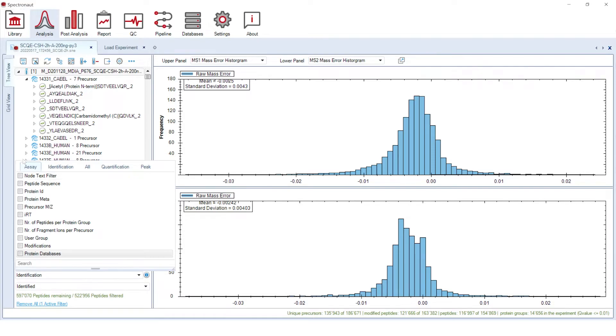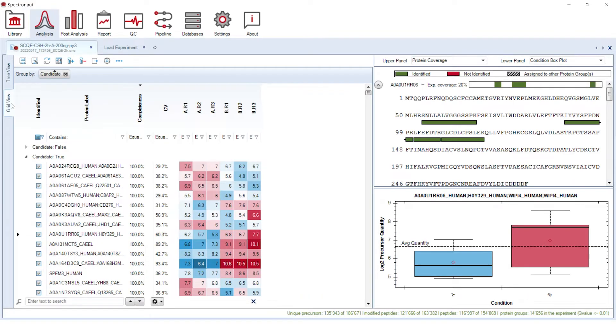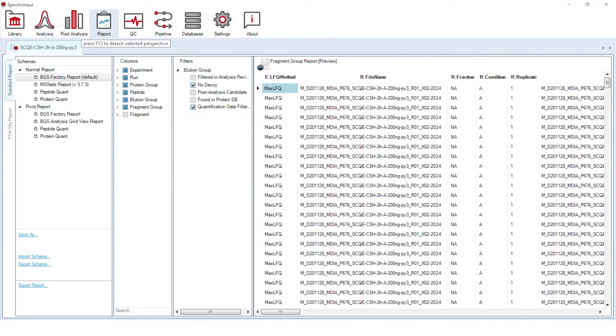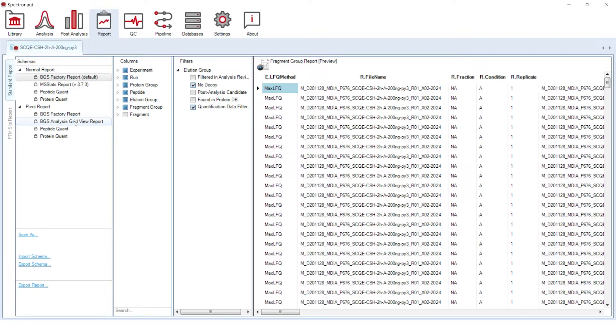The grid view, on the other hand, offers a user-friendly overview of the quantification results displayed in a protein group-centric manner. Grid view data can now be easily exported from the report perspective using a dedicated grid view report schema.